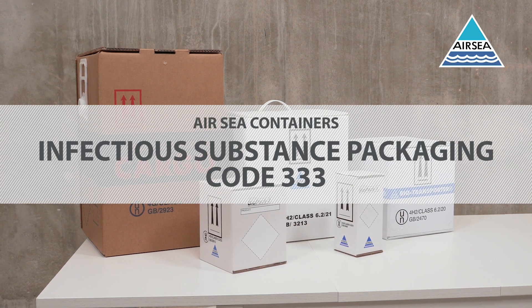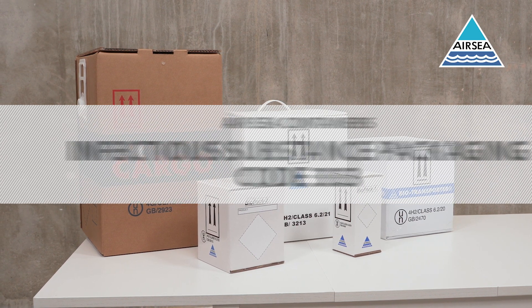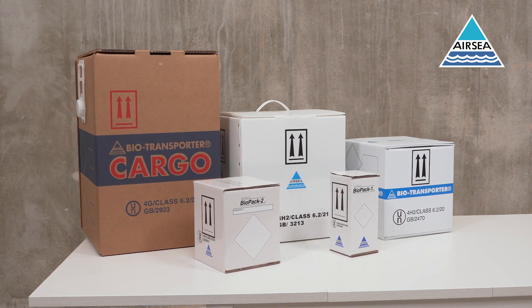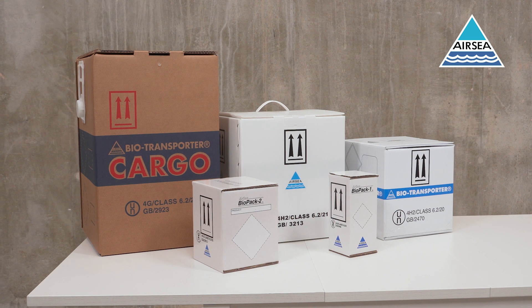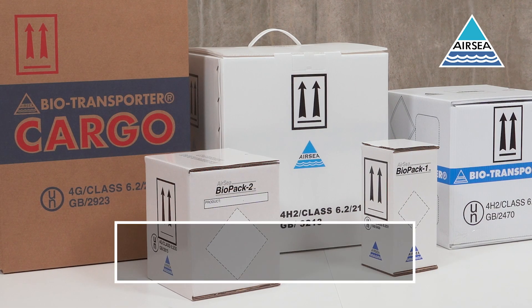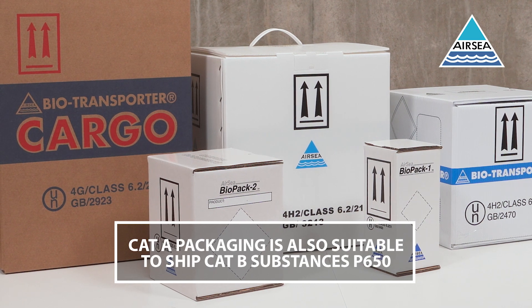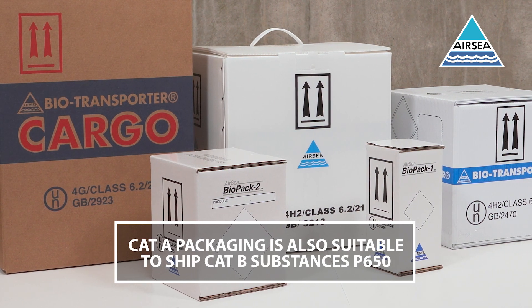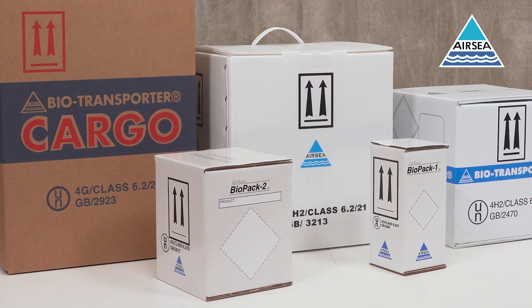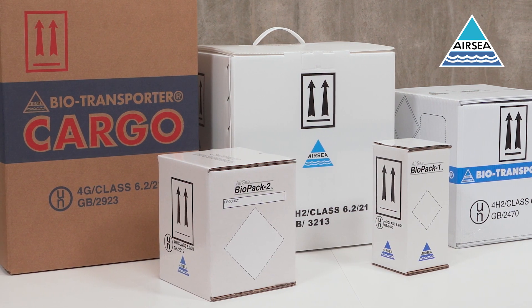Airsea containers have a range of UN-approved packaging suitable for the transportation of Class 6.2 infectious substances. The BioTransporter 1 temperature control packaging comes pre-assembled, is tested with dry ice, and is UN-approved for shipping UN 2814 and UN 2900. It is immediately available from stock with no minimum order quantity.